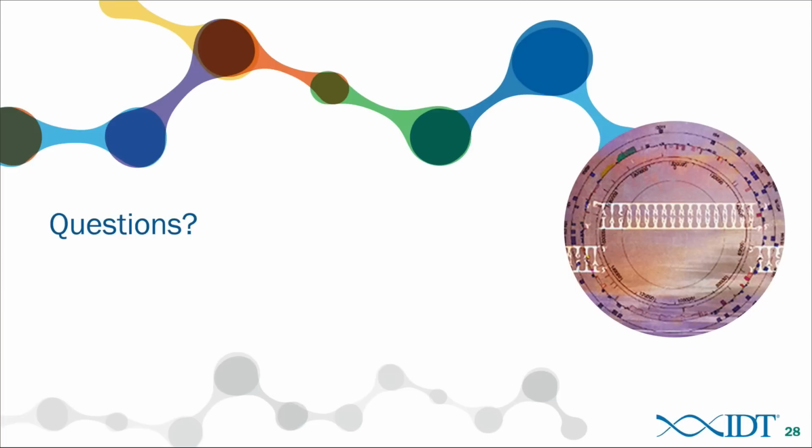Okay. This next question is, could you comment on the feasibility of incorporating the Alt-R CRISPR design strategy in a pooled screen, and then it says 500 to 1,000 CRNAs per gene, for example, or 500 to 1,000 genes?